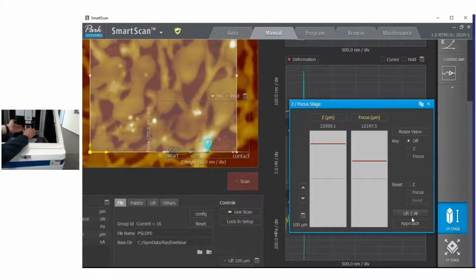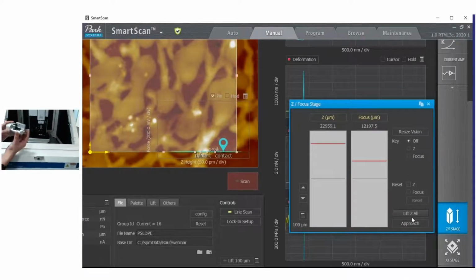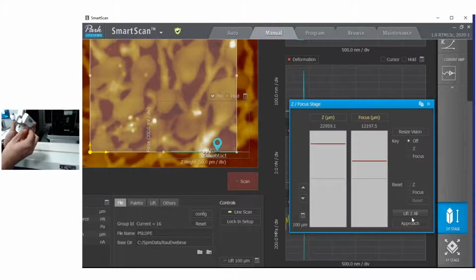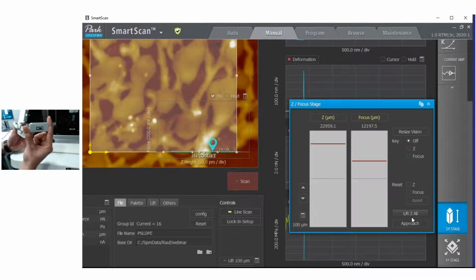It's really easy to handle the hardware of this tool. This is the scan head that we use. That's a pre-mounted cantilever right there. I don't know if you can see it. I will change this to a conductive cantilever now. And additionally, I have this head extension module, which is for conductive AFM, which I need for the conductive AFM that I have to show you now. This is basically a preamplifier that we will need now.